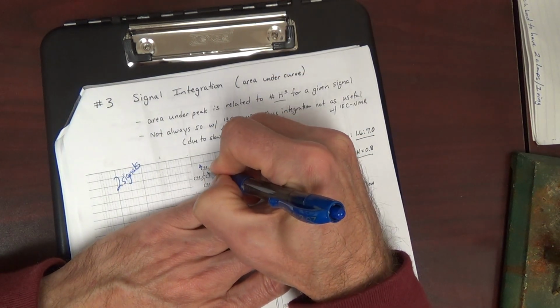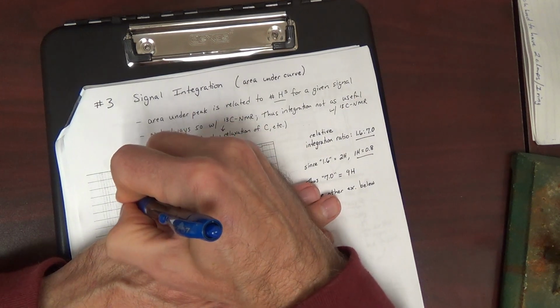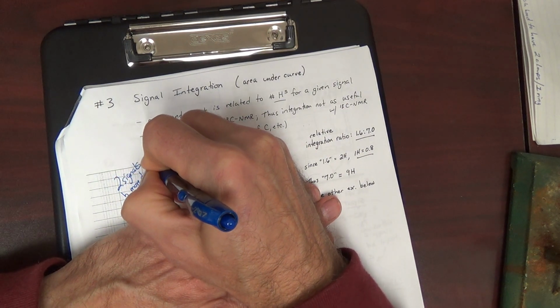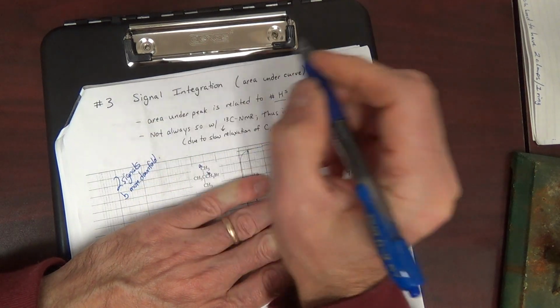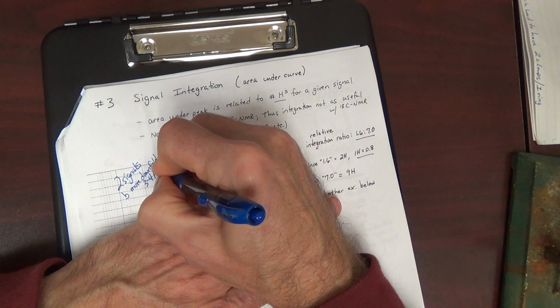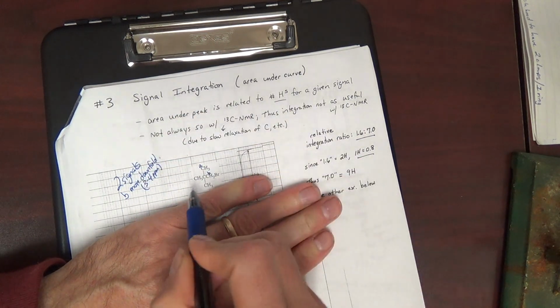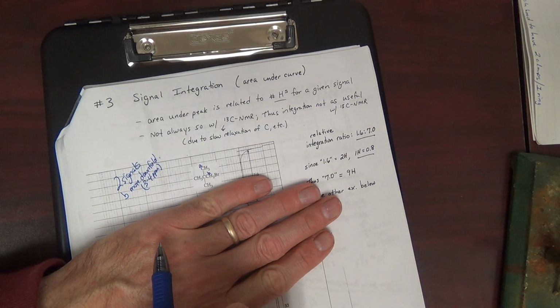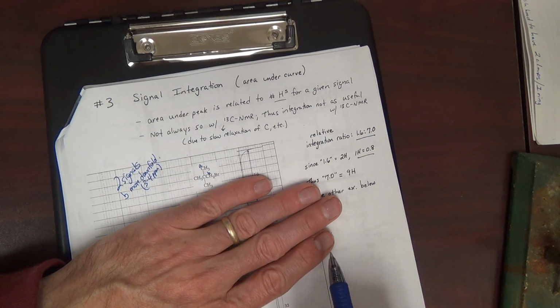A and B. I would expect B to be more downfield, in that sort of 3 to 4 range, because the carbon is bonded to an electron withdrawing group. All right. And that's what we've done thus far, right?